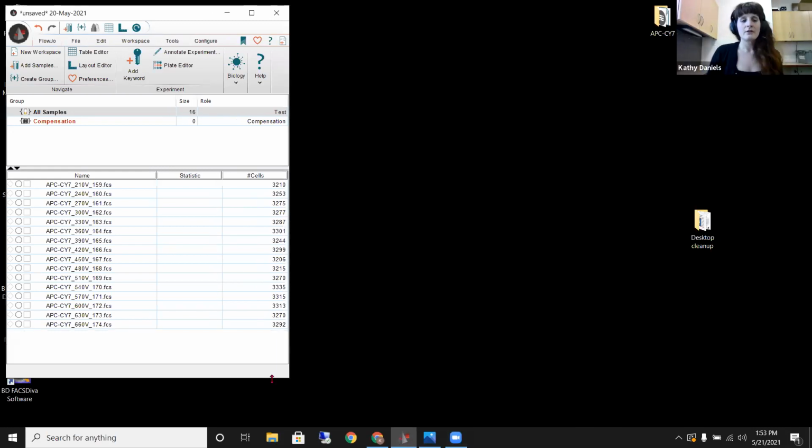All right. So now that Derek has given us our introduction into analyzing some files in FlowJo, what we're going to do now is we're actually going to take the time to analyze a similar data set from one of our previous OpenFlow sessions. As you can see, I already have the FCS files imported into FlowJo. And we actually have the file names coming up right here. And as you can see, what we're looking at here is cells that were stained with an anti-human CD4 APC-Cy7.